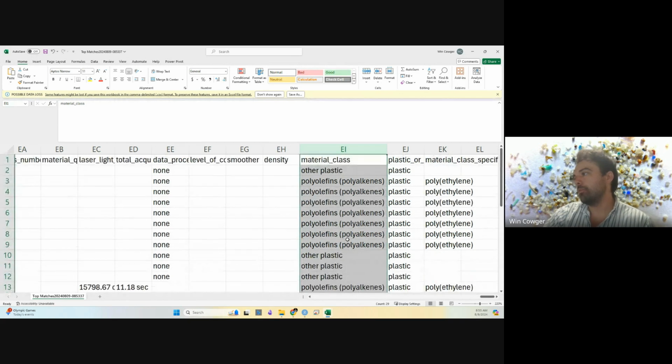Hopefully it's been really fine tuned for plastic pollution, but I also realize some people are using Open Specy that aren't trying to do plastic pollution research. So if you have some of those use cases and you want to use Open Specy to do mineral analysis, right now the classes are just getting lumped to mineral, but maybe you think it would be useful to have minerals broken up into different groups. I would love to make that as an added column in the data set.